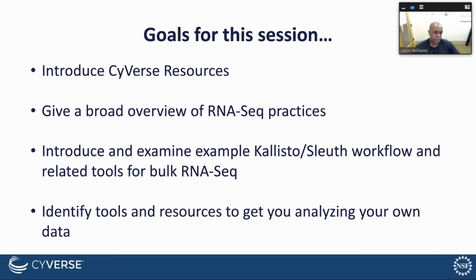And in particular, I'm going to be introducing and examining the Kallisto and Sleuth workflows. These are tools related for bulk RNA-seq. I won't necessarily be discussing single cell today, but these actual pipelines and workflows exist for single cell as well. And it's really about getting you to identify these tools and resources so that when you are ready to work with your own data, you are positioned to do that.